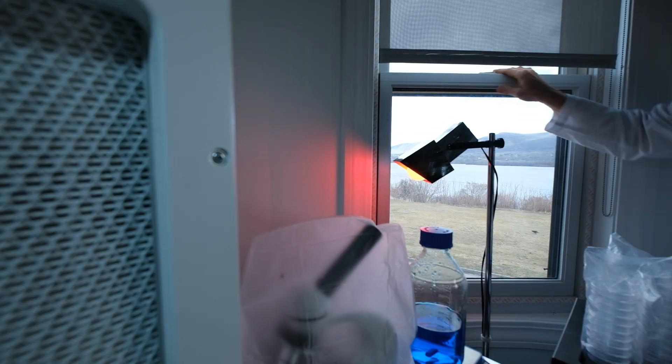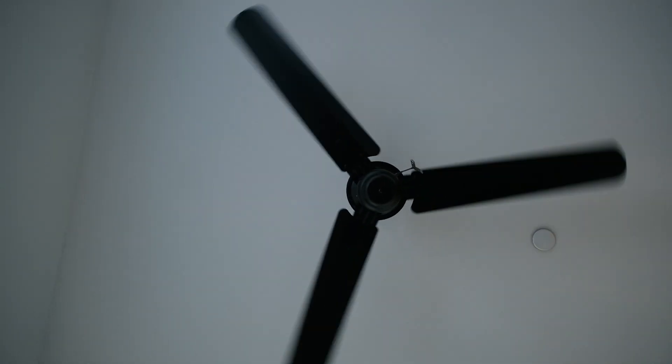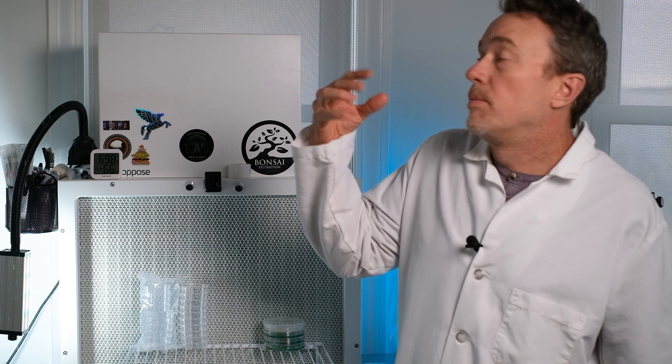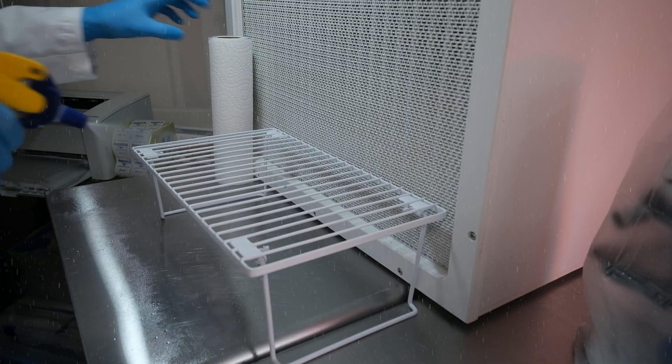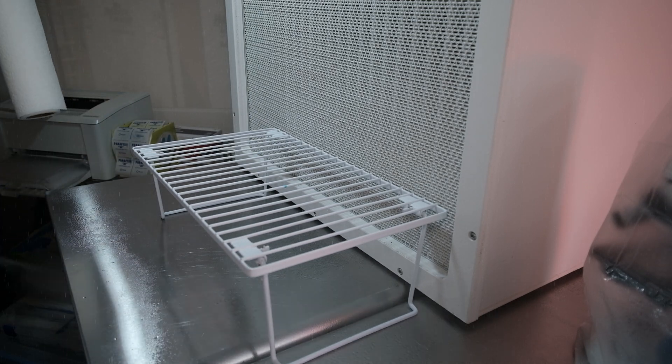Tip number two: close all your windows and turn off any circulating air in the room at least 30 minutes before you start. This gives all the airborne contaminants and particles that are floating around in the air time to settle onto the surfaces. Then you can spray them with 70% isopropyl and you can wipe them all off.